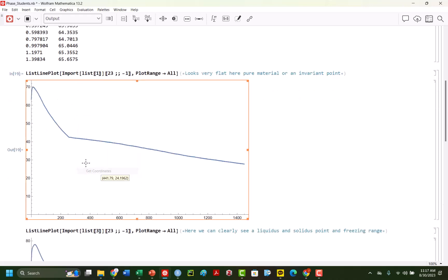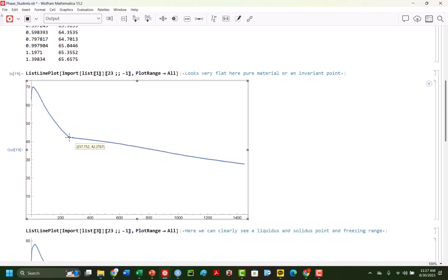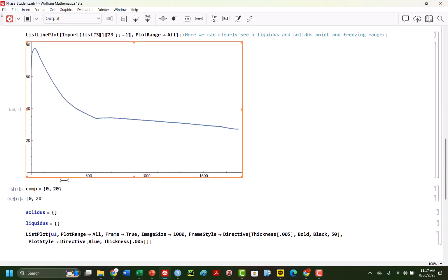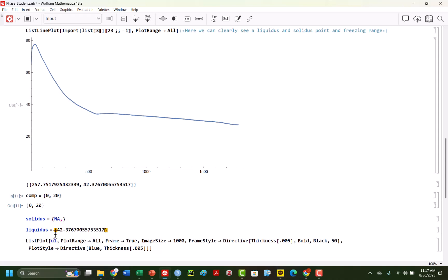So we can identify that liquidus or that invariant point. So I'm going to just right click and then like, sorry, let me do this again. Right click, get coordinates, and I'm going to click right here approximately. And then I'm going to control C. And I am going to paste this in here. And I don't care about the x-axis value. I just need the temperature. So at zero composition, we don't have a solidus, but we do have a liquidus. Because again, the liquidus on our phase diagram is when we go from liquid to salt.